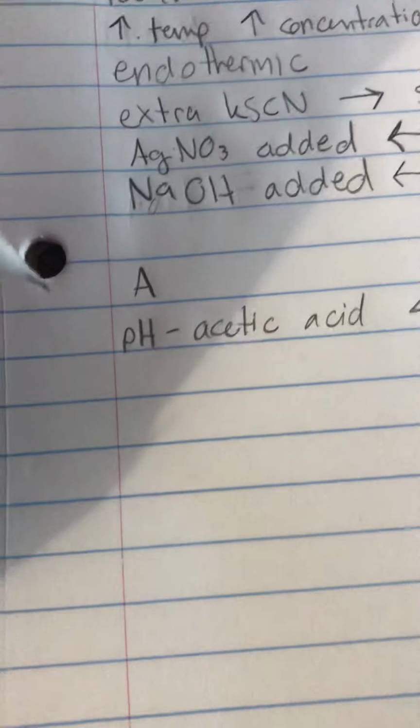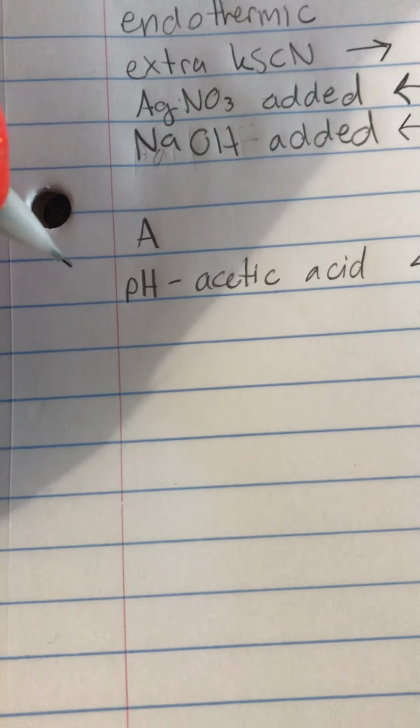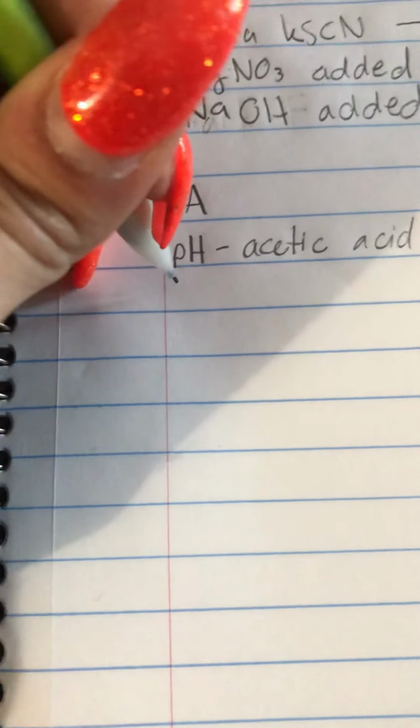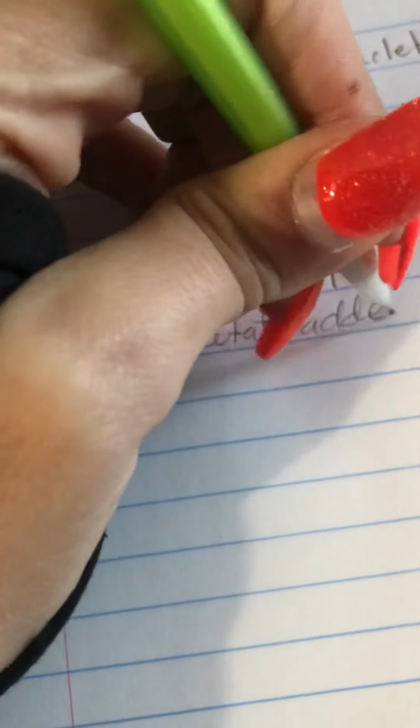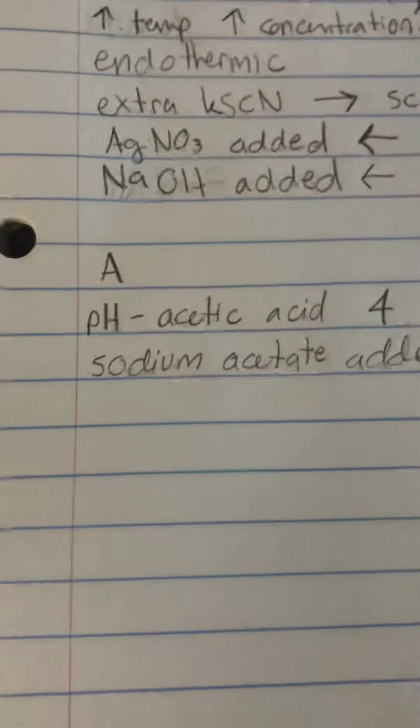So the next question says, explain what happened when sodium acetate was added. Well, when sodium acetate was added, the pH became 6.